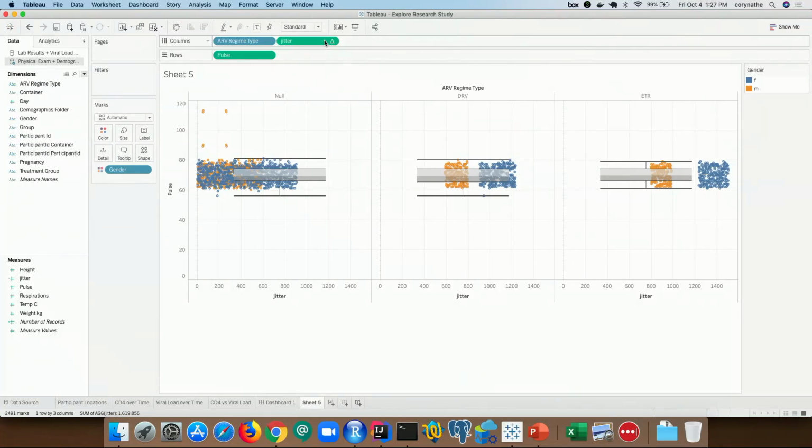And then this can be saved to my Tableau workspace. Again, when I reopen Tableau tomorrow, after I make my credentials login, it will have pulled the latest data. I think there are options in Tableau to extract the data rather than use a live feed. I'm not real familiar with all those myself, but this should hopefully give you an idea of what that ODBC connection makes available for tools like Tableau or Microsoft Access, Excel, those ones that were listed on the slide that Xing did.